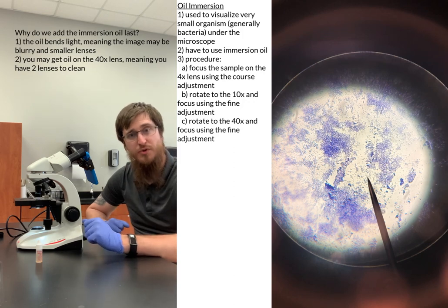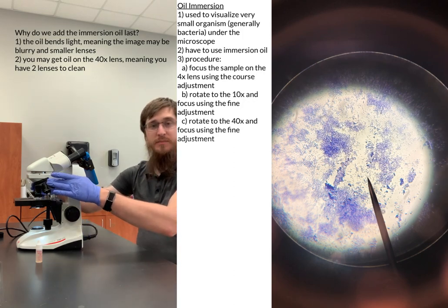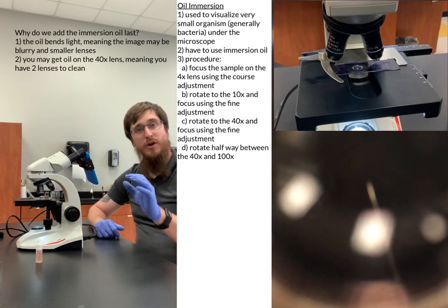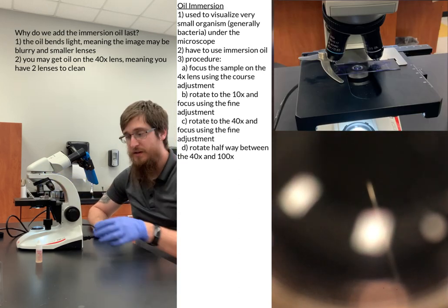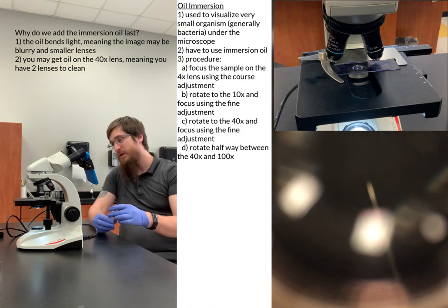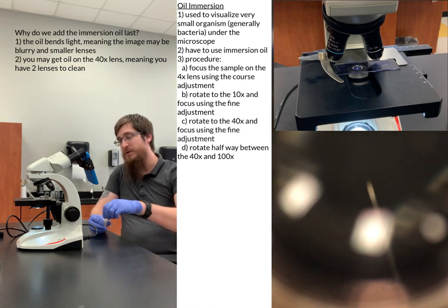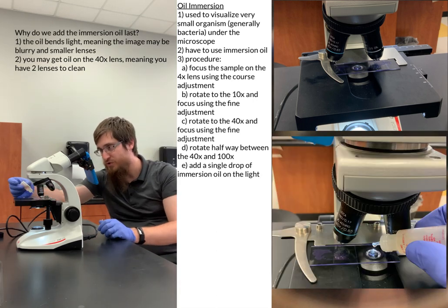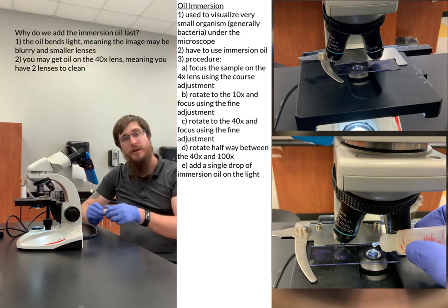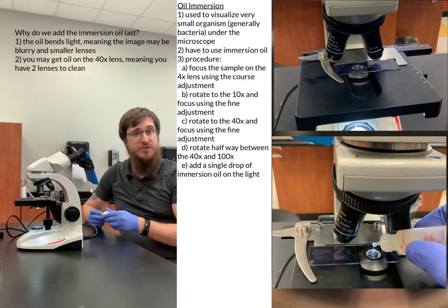I'm going to do my oil immersion. And what I'm going to do is that I'm basically going to move halfway between my 100x and my 40x. And now I'm going to take my little dropper with my immersion oil and I'm just going to put a single drop of immersion oil right where the light is located. And that's basically how we do the oil immersion technique.